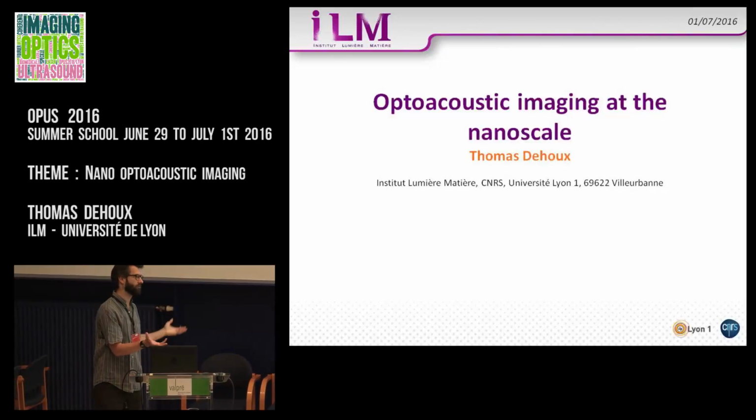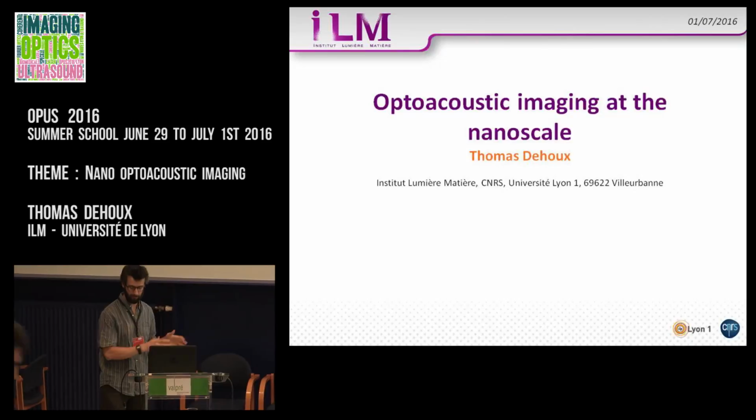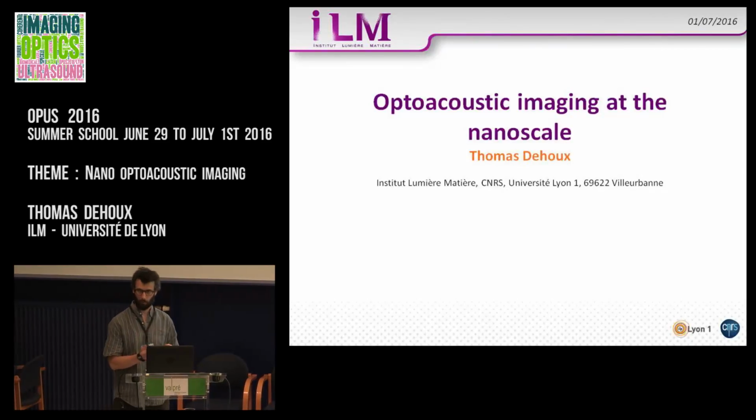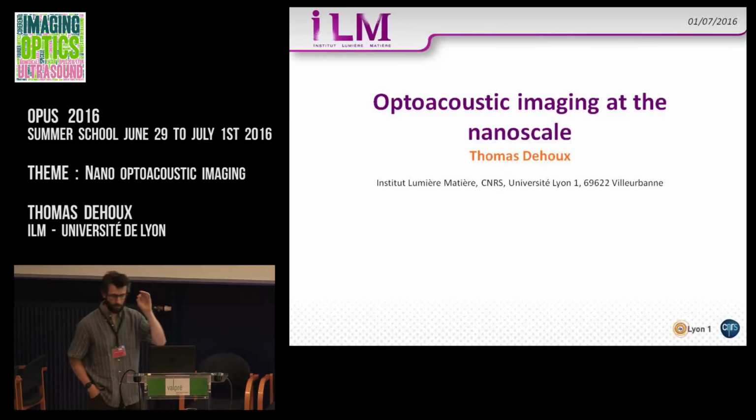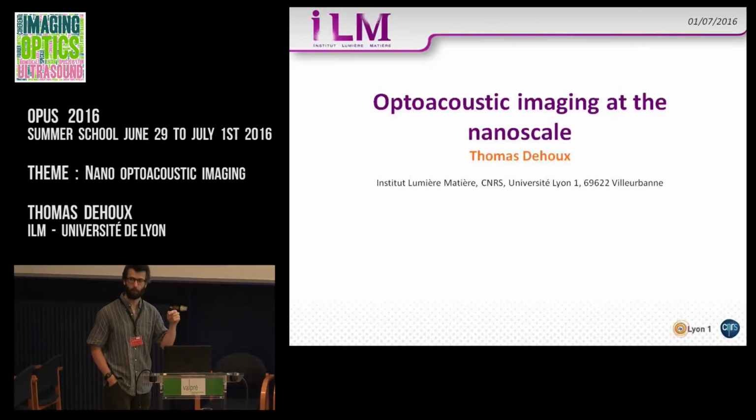I will show you some examples on single cells, how we can use that to image the mechanical properties of single cells. The aim here is not to obtain, like in photoacoustics, images based on the optical contrast of the tissues, but images with mechanical properties as the contrast.